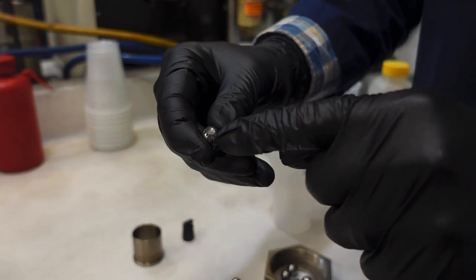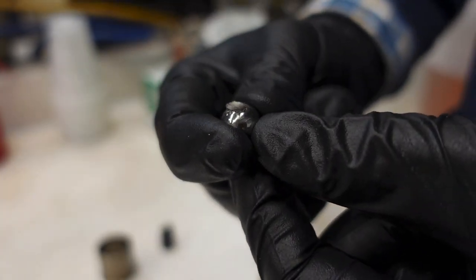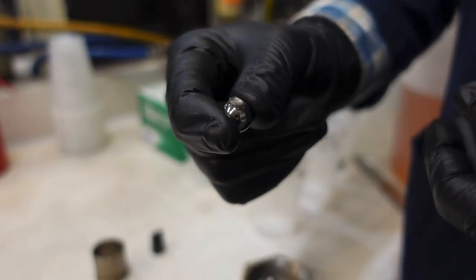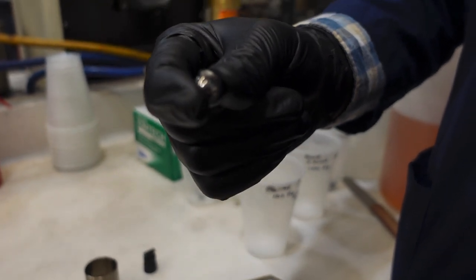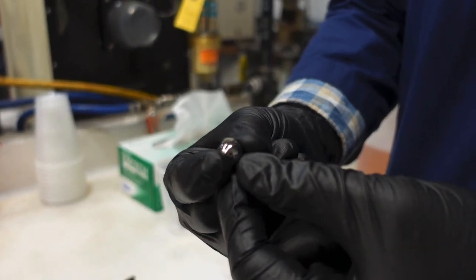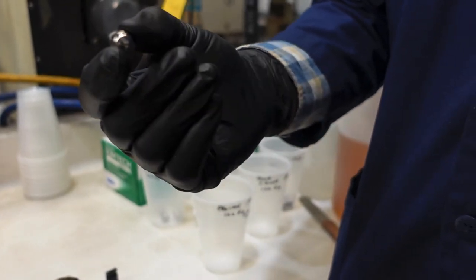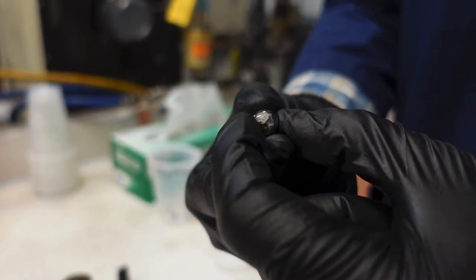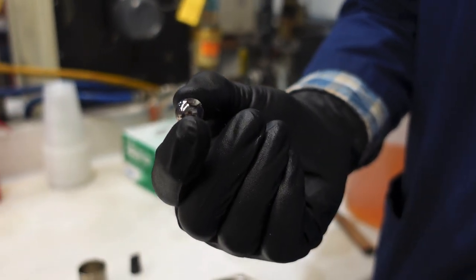The friction between the balls as they move simulates any two pieces of metal — it actually smeared the metal, that's how much pressure is being applied. The heat of the friction is hot enough to temper the stainless steel and actually get it to melt — it loses temper, becomes soft and flows. So this simulates an extreme condition — maybe you hit a nail or a burl or a bullet or something in the piece of wood you're cutting and your chain locks up. This would be an extreme case of damage that we're trying to prevent using our additive chemistry in the product.